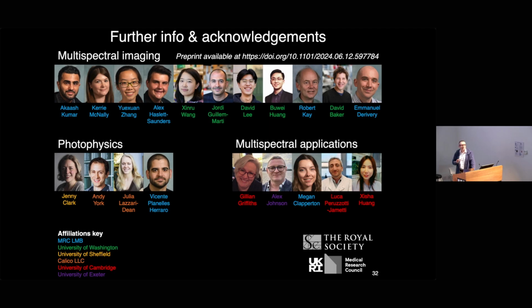Changing the chromophore was a bad idea. That turned out to be really hard. For this particular one, we've just put a pi stack above the chromophore and then tried to work out how to stabilise that so we don't lose the quantum yield. For the other colours that we're trying to make, we're actually starting with other fluorescent proteins that already exist, like mScarlet, mCherry, those kind of things, and then putting in an environment that mimics that StayGold environment around the chromophore to see if that gives us the spin-orbit coupling that we want.